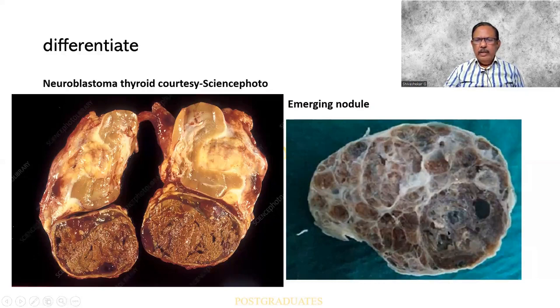Otherwise, it can be mistaken even for a dominant nodule, as you are seeing in the case of a multinodular goiter. So it is this kind of a thing. A nodular goiter, you should know what kind of histology it has. I would like you people to kindly visit Ackerman for the varying stages of the genesis of the thyroid tissue.